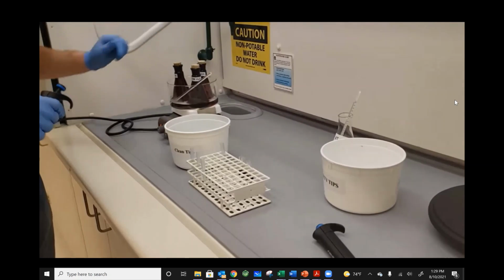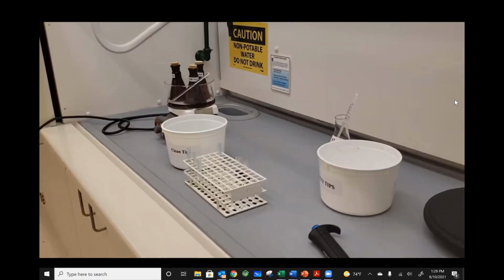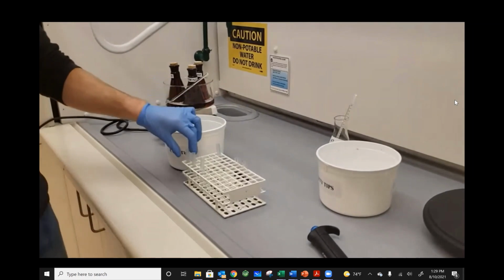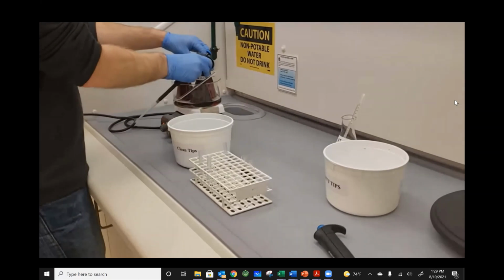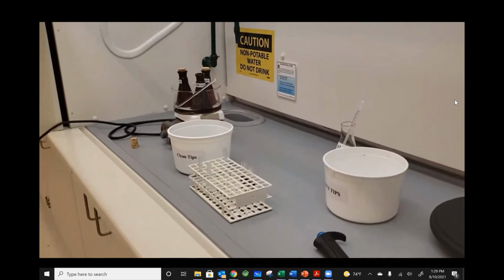Yeah. So here is my 1-4 test tube. Here is my tip for hydrogen peroxide. And if I remember correctly, I need no water for these trials. That is correct.